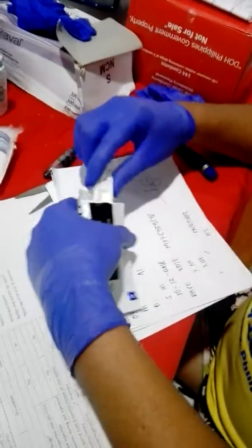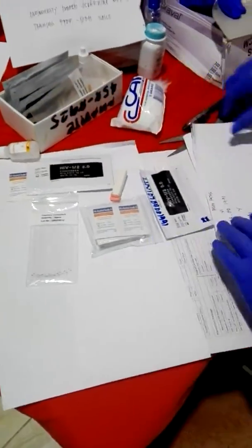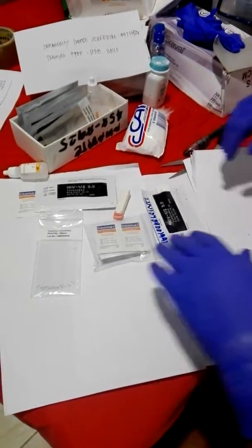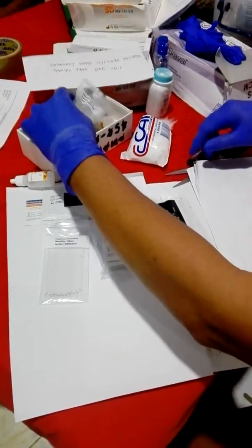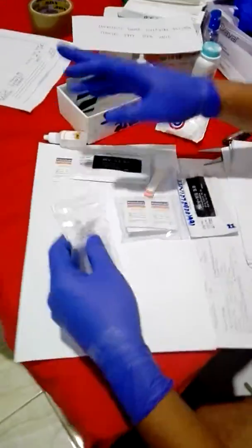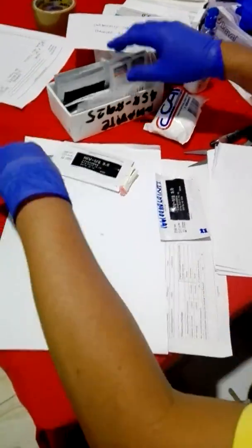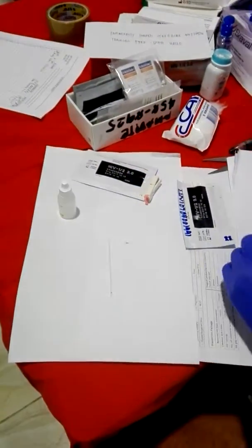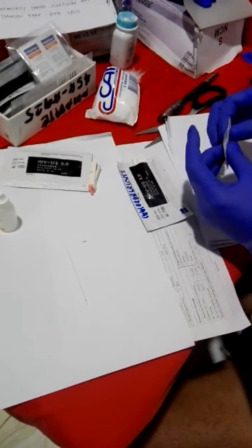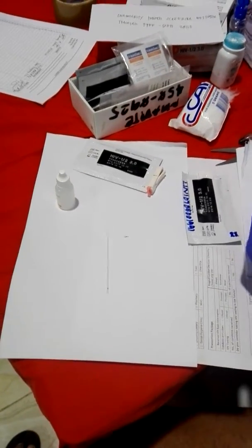So this is the next step. The next step you need to do is to label the medical kit in order to prevent improper results. Labeling is very important. The label is based on the number of the patient, not their name or last name. They have a specific patient number or code. In that way, they will know that that particular result is for that patient, to prevent misdiagnosis of the result.